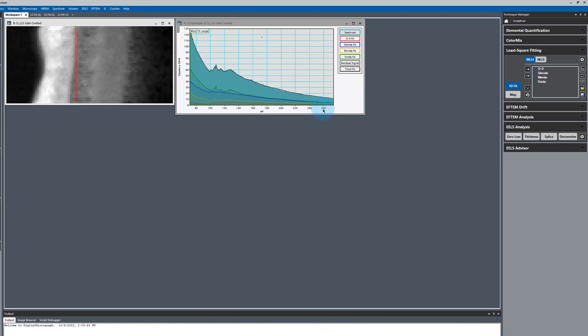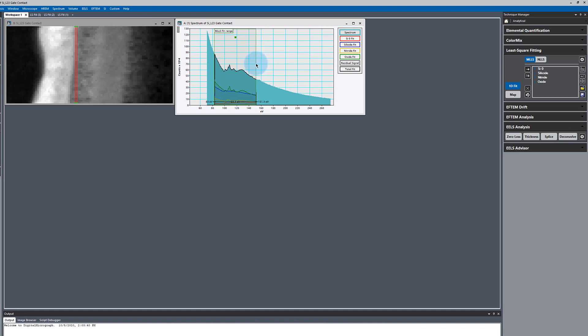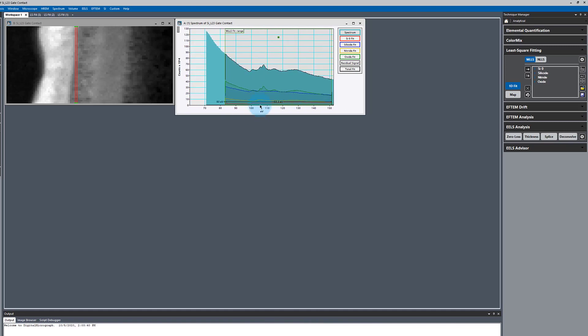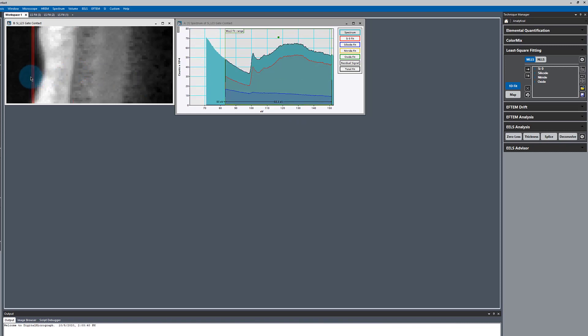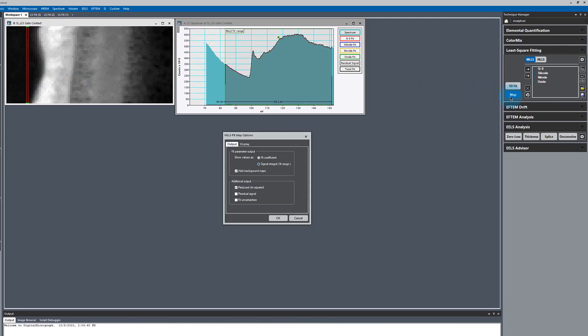We've got all of our references set up. The only thing I might want to do differently now is maybe change the fit range a little bit. So I'm just focusing on the fine structure of the analysis. And if we say map.